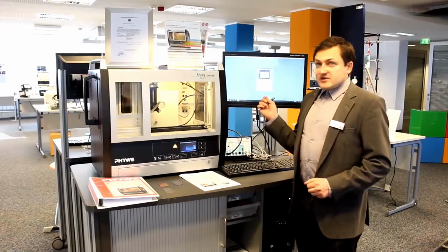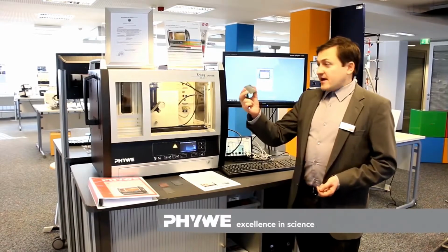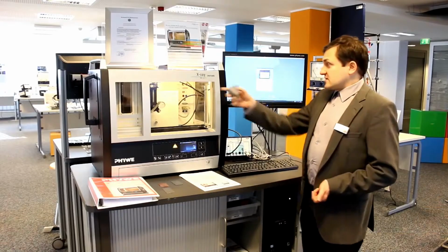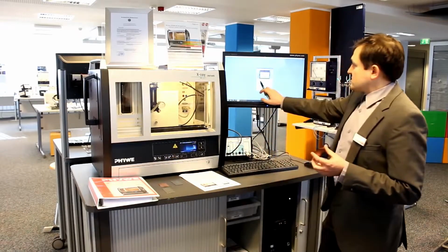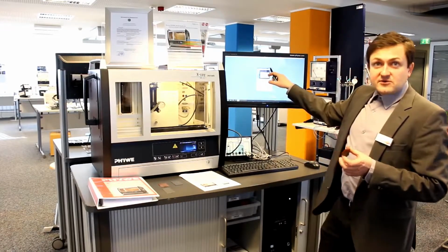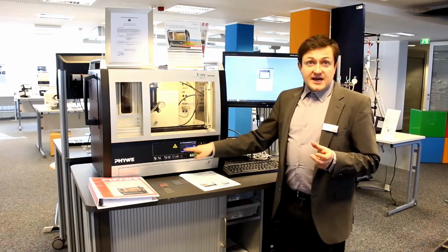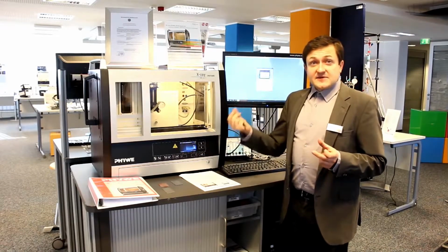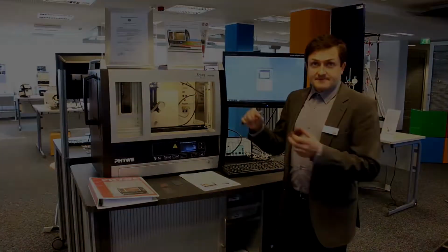So now the calibration is done, and the next step is to study the spectra of constantan and do the elemental analysis of constantan. I put the sample inside and I use the spectral recording option of the multi-channel analyzer software. I also use the timer of the X-ray to always keep the same exposition. This time it will be 10 minutes.